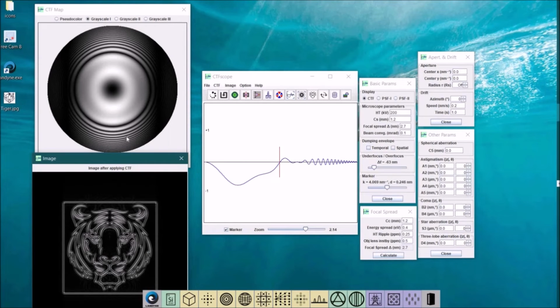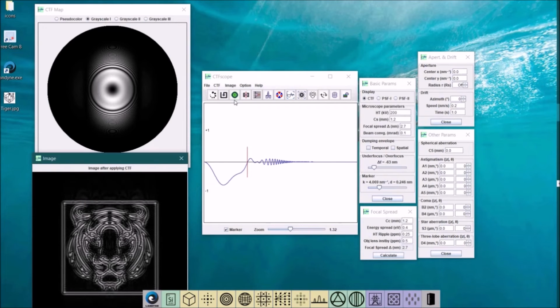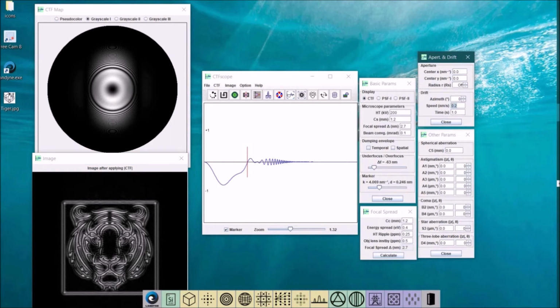You should compare this one without drift. More effect on the image. Yeah. So now you see that the drift degrades your image. And now see the, yeah, it's a little sharper, but it's still better than the pattern before without the drift. So put it to 0.